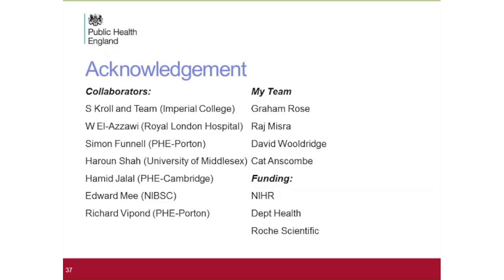If we can now transfer the data sets from that for each one of these genes into reference data for microbiome analysis, then we would be able to assign not necessarily at this stage the exact gene, but the function of each one of these genes or which pathway they fall in by comparative analysis. So metagenomics cannot move forward without having full microbial genome sequencing happening at the same time for a large range of organisms within each one of these taxonomical groups.